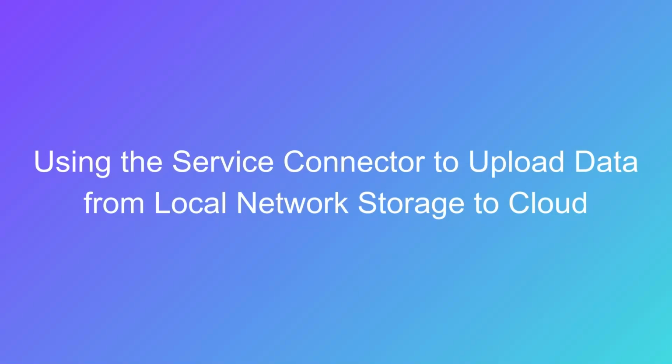In this video, we will demonstrate how to use the Service Connector to upload sequencing run data from your local network storage to an ICA project that is configured to an external cloud storage provider. In other words, sequence to cloud without using a BaseSpace managed project.